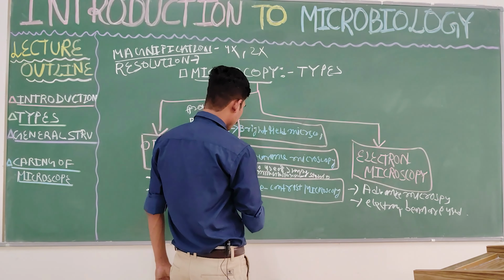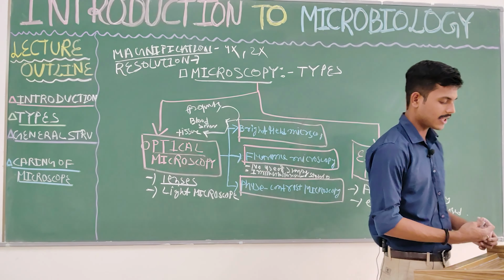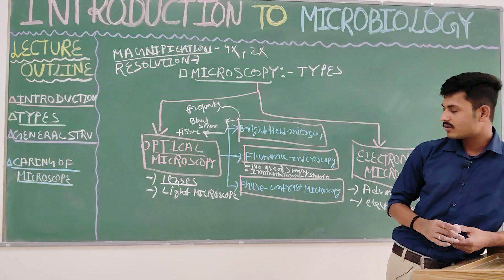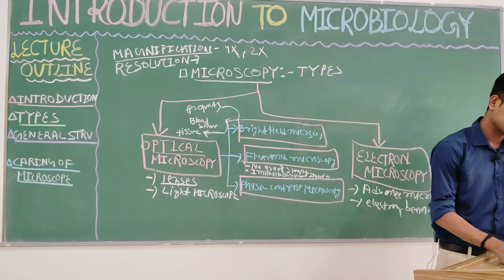Now come to the phase contrast microscopy. We use this also without staining the specimen.